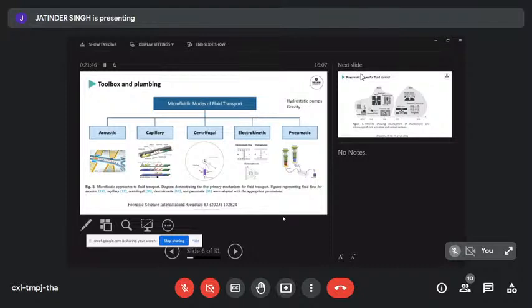with water, on a hydrophilic surface. We'll spend a little bit of time on centrifugal forces, which is really cool, because if you get a disc spinning, centrifugal force pushes you to the outside, and you can use that to control liquids, because the forces change depending on your spinning speed, which gives you control to move from one chamber to another. A little bit early to have on the list now, but tomorrow Phil will be talking with great delight about the electroosmotic flow, which allows us to move liquids electrokinetically.